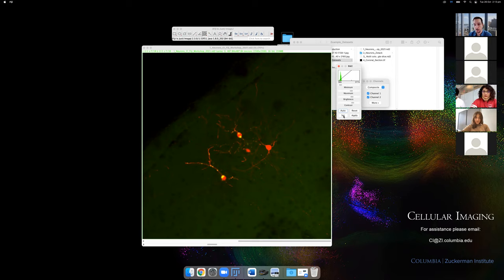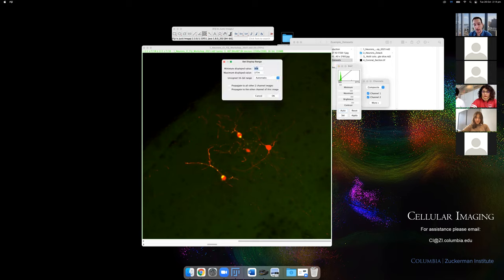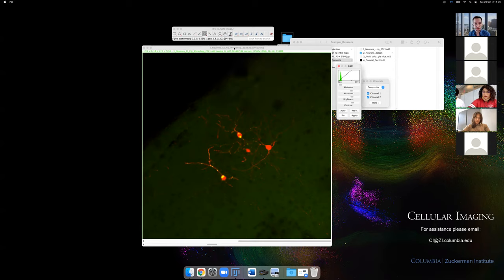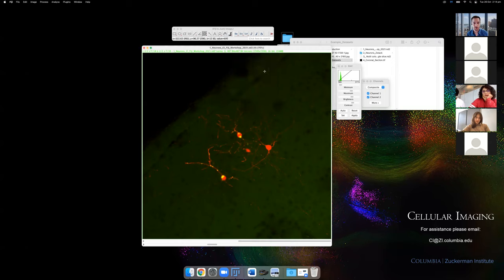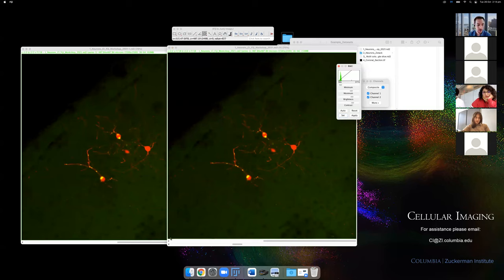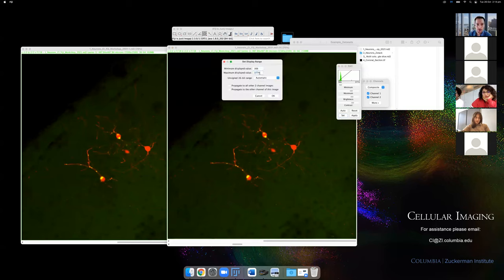There's a 'Set' option that lets you be very specific about what changes you're making — you can type in exact values like 400 for the minimum and 5000 for the maximum, rather than dragging the slider. You can also propagate these settings to other images, so if you're comparing five different images from different experiments you don't have to repeat this for every image.